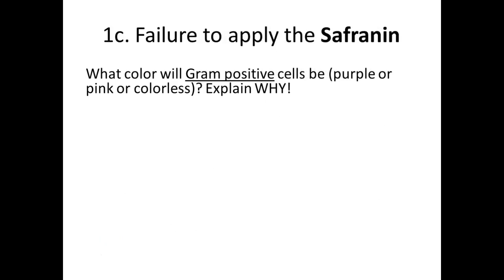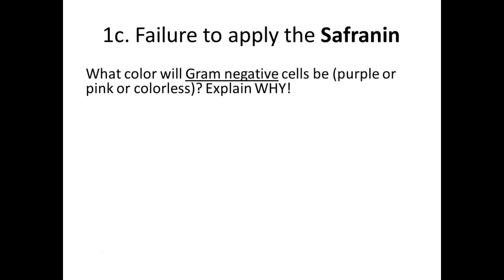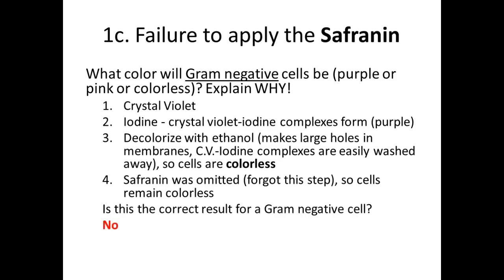What if you forget to do the safranin? For gram-positives, is this going to matter? No, you're just going to end up with a lighter purple. No big deal. What about your gram-negatives? They're going to be colorless. You're not even going to see them, right? Yes. The reason why we use the safranin is to see them. So this would be bad because you wouldn't even be able to see them.